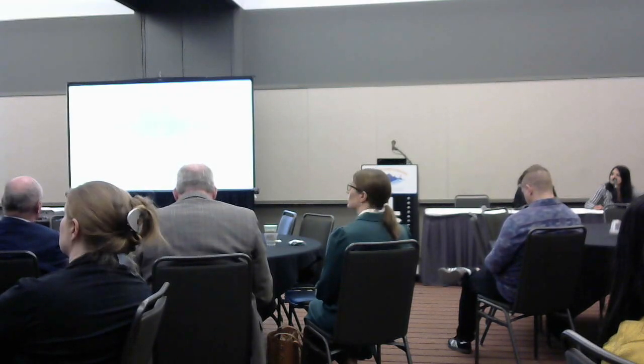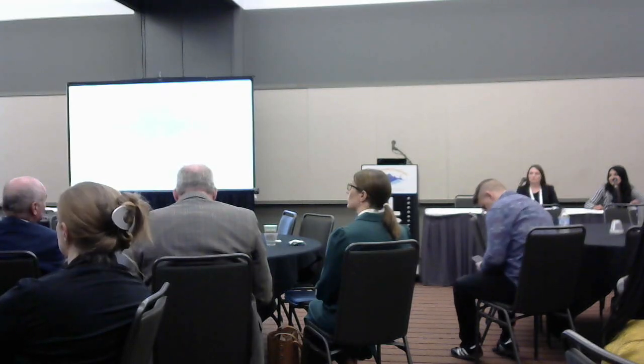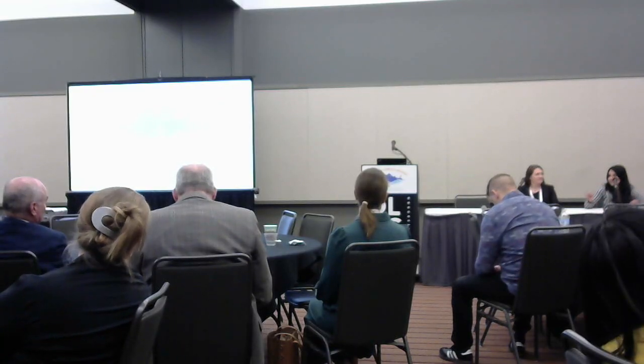I know this is a good discussion. We're not going to solve it now, but I think the raw data matters because if you publish later and you need to put up your raw data even before destriping, because that's a processing step, I don't know how that works. It's been discussed for a decade or more, so we're not going to solve it now, but I wanted to hear your thoughts. Maybe that's a question for the next 4:30 session.